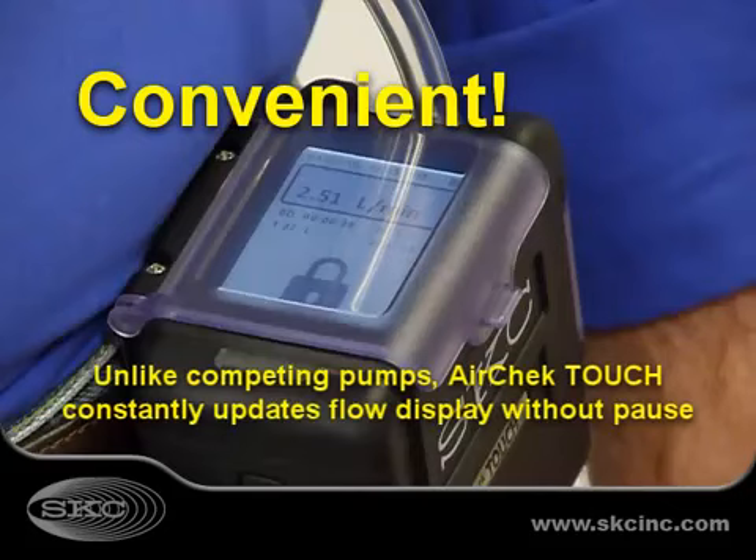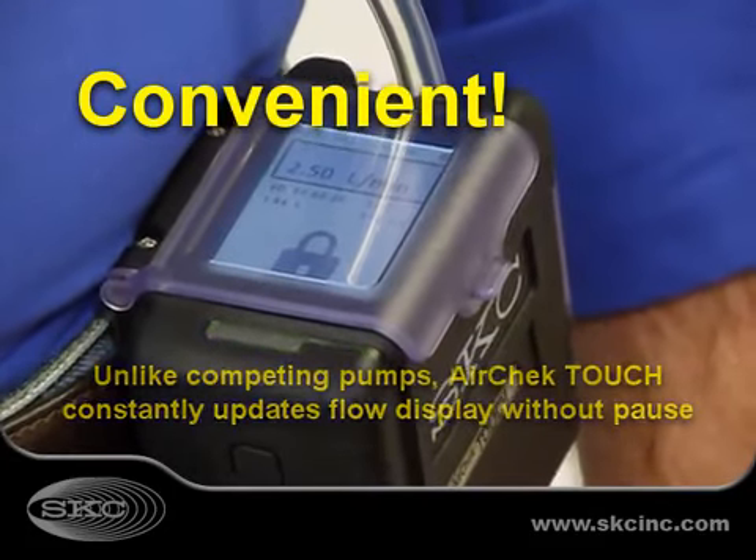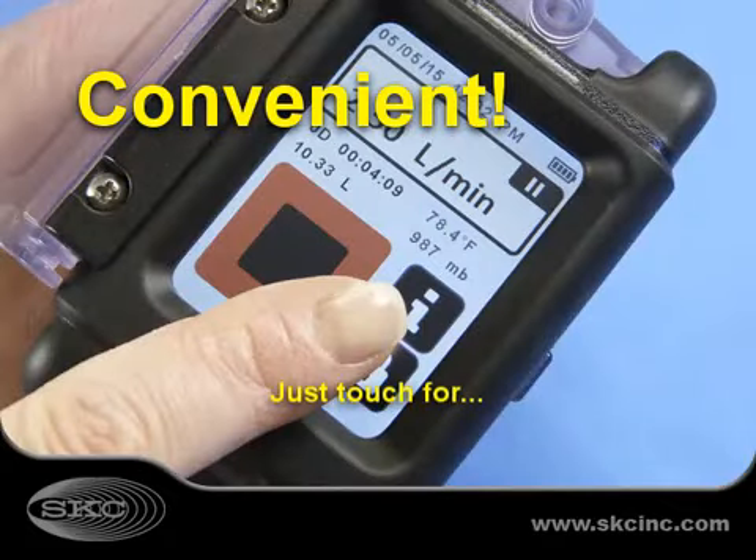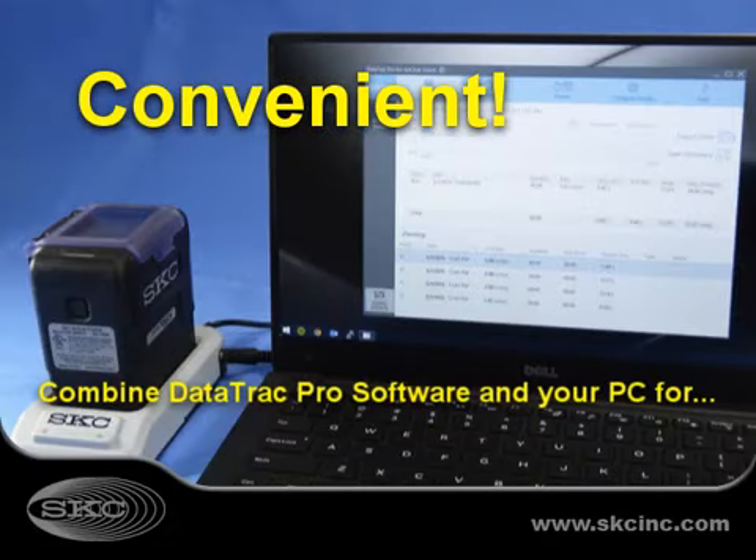Unlike competing pumps, AirCheck Touch constantly updates flow display without pause. Real-time sampling information is only a touch away. Expand AirCheck Touch operation with DataTrack Pro software.